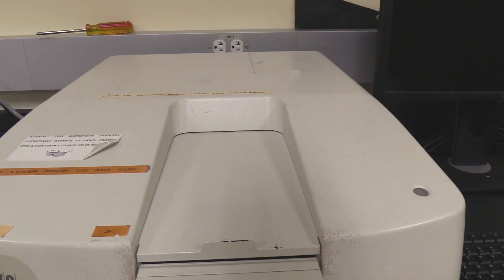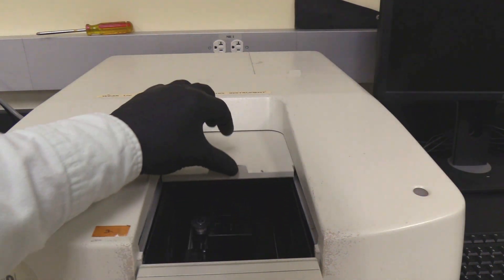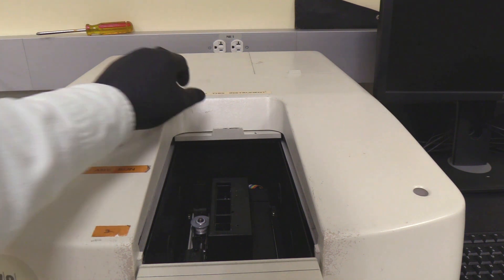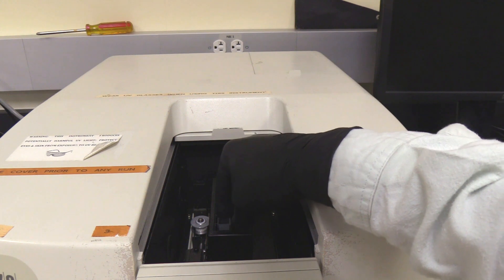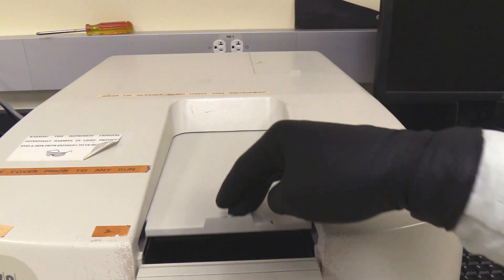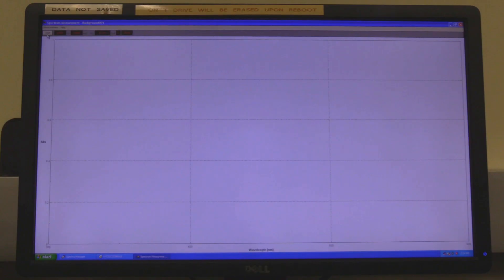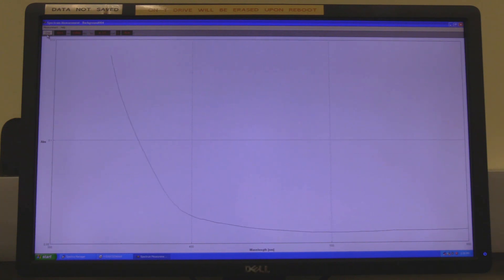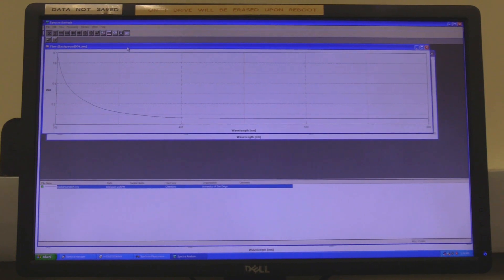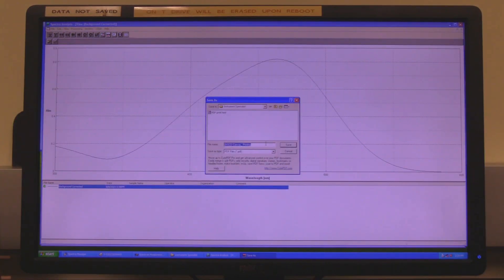Slide open the sample chamber lid. Insert the cuvette so the clear sides are aligned with the beam direction. Be mindful that the beam path is right to left. Place the blank cuvette in the sample holder and close the lid. Click on the start button. When the measurement is complete, spectra analysis will automatically open. If the autosave box was not checked, in spectra analysis click on file and then on save. Find the appropriate folder, name the file as blank and click on save.